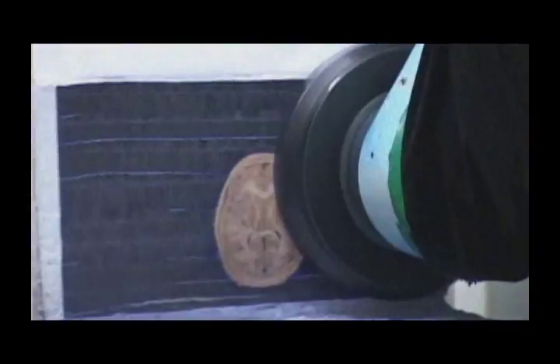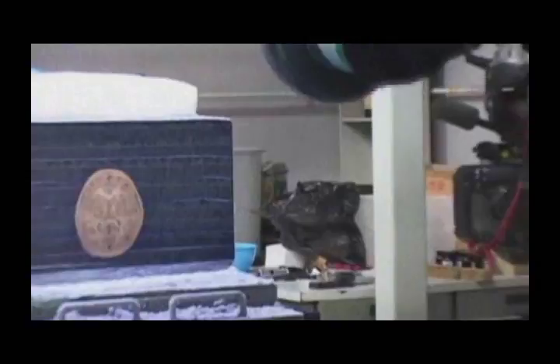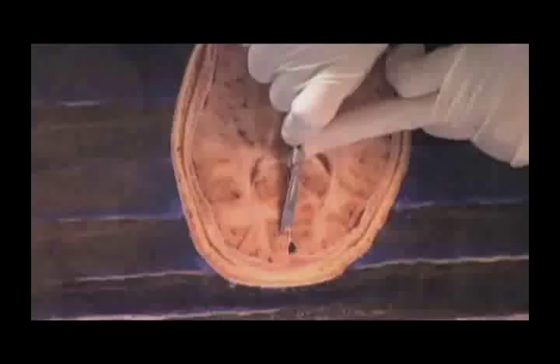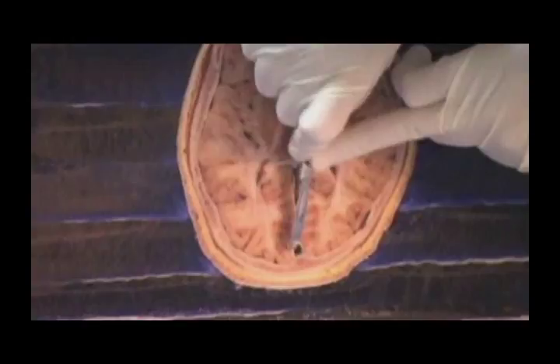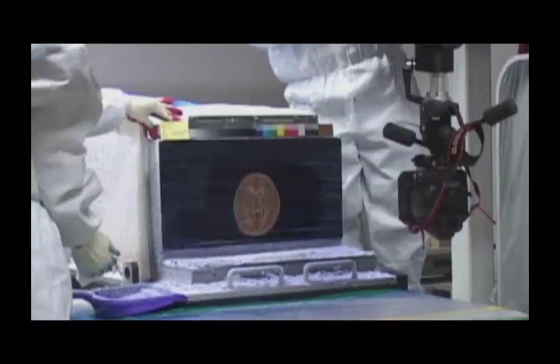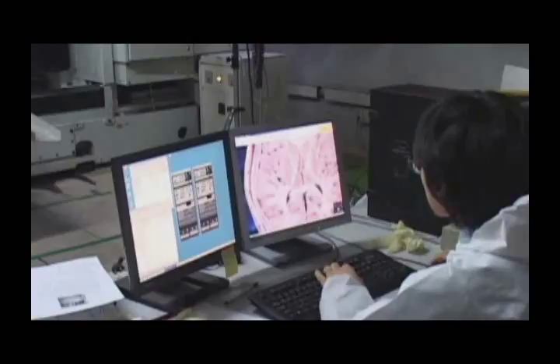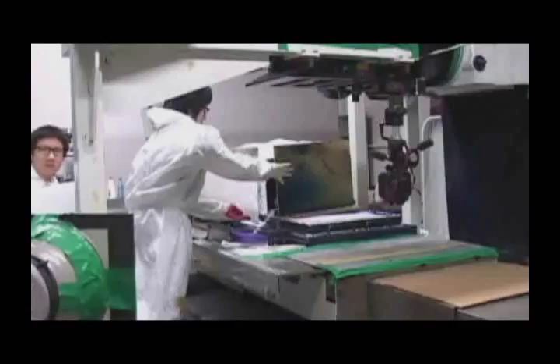Normally, I cut them to be 0.2mm thick. We clean the frost on the cut side and trim the sides. We then take pictures of the cut sides using a digital camera and make sectioned images. This process is repeated to create the sectioned images.